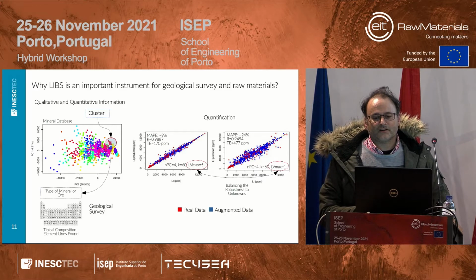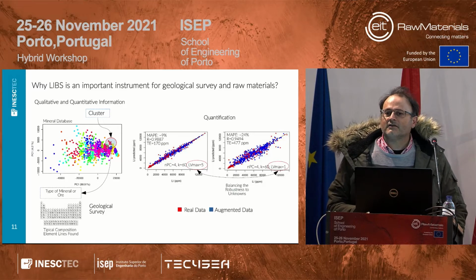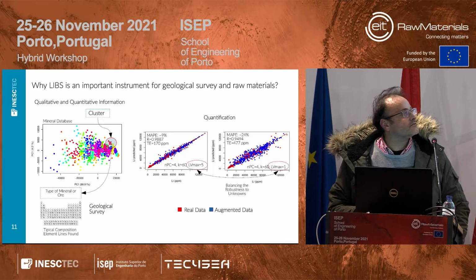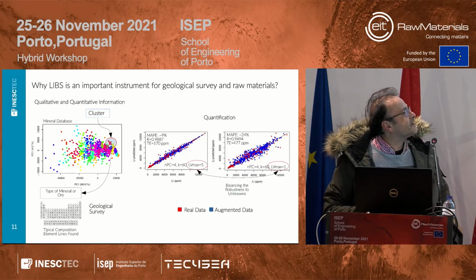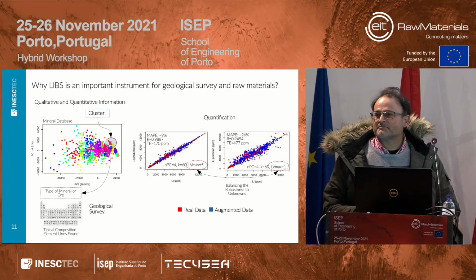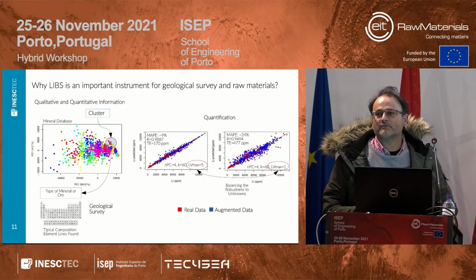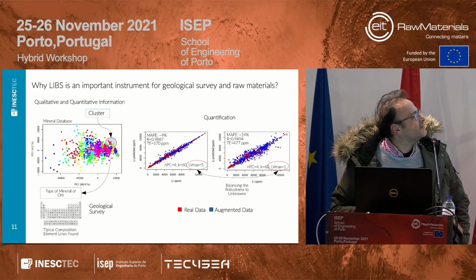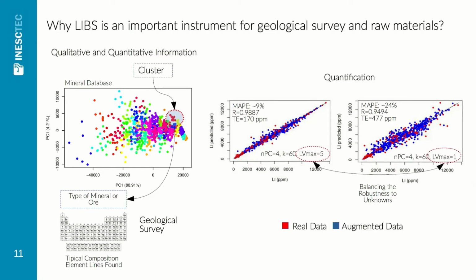In engineering, we are able to use methodologies even where there are still many unknowns. In this case, we are using chemometrics and machine learning to try to unscramble the information from the LIBS spectra, which is highly complex, and to figure out how to use the information to quantify, for example, in this slide, the lithium quantification from exploration drills in the Barroso mines here in Portugal.